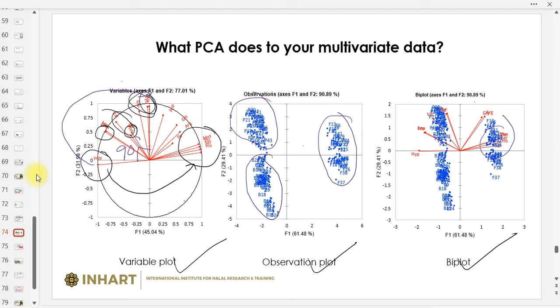For porcine, they are high in this variable. Tak ingat apa nama dia. So there are 3 or 4 amino acids that are dominant in porcine. So if we analyze the amino acids and see a high content of a particular amino acid, we can propose that the gelatin we are analyzing might be from porcine. Okay.